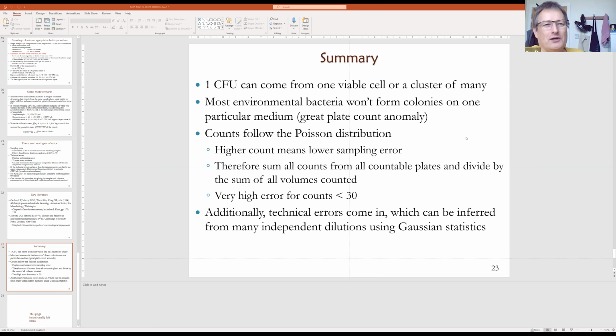And E. coli as an example, E. coli is one of those organisms which is very difficult to not grow. I mean, you have to be extremely harsh to them that they won't grow. They grow in phosphate buffer media. They grow in rich media. They grow under aerobic conditions, under anaerobic conditions. They grow, and that's why they are so used in the lab, because E. coli, everyone can grow E.